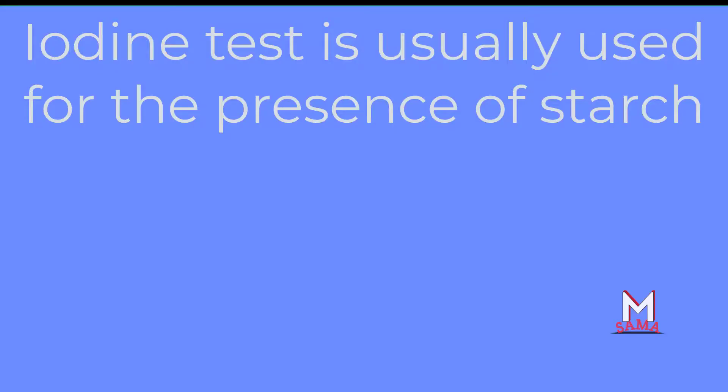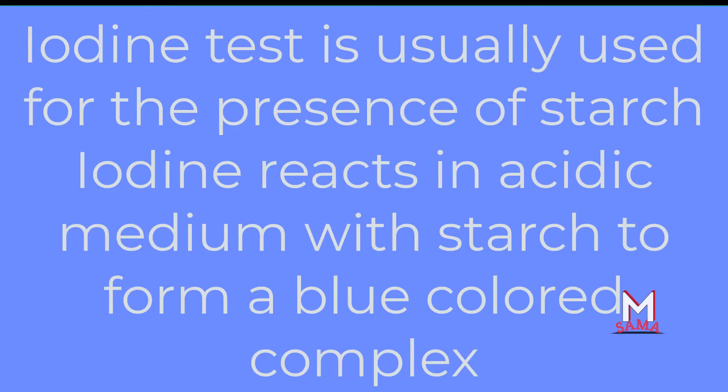In this video I will demonstrate the iodine test. The iodine test is usually used for the presence of starch. Iodine reacts in acidic medium with starch to form a blue colored complex.